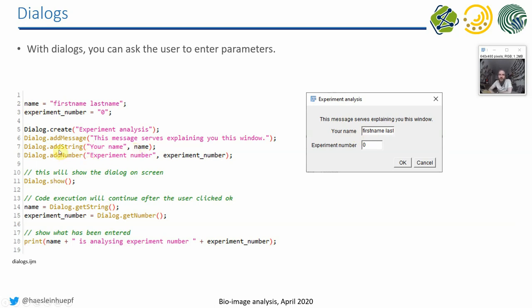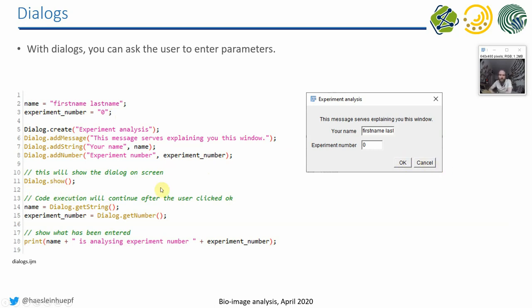And then I can also ask the user for entering a number, for example, the experiment number. And again, the default value experiment_number is a variable defined here. So I can ask the user to enter a number. Then I show the dialog, and then this window will pop up. The code execution will not continue until the user clicked on OK. So this is how a dialog works.